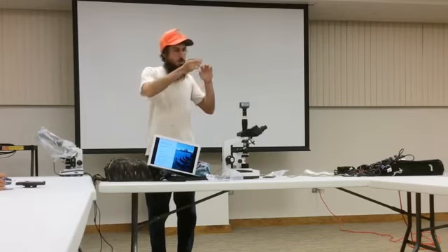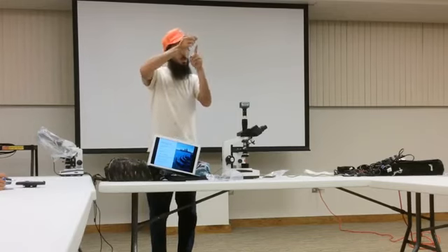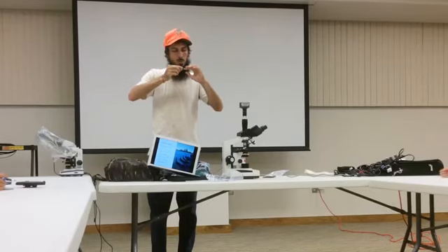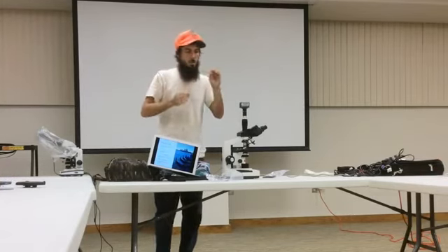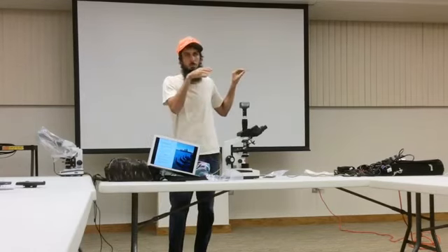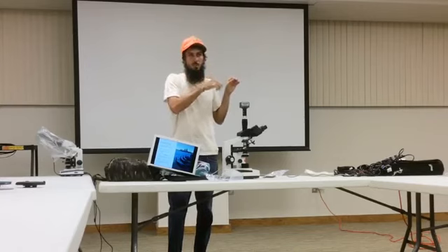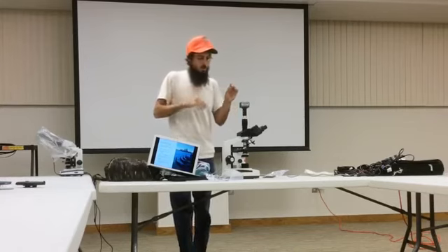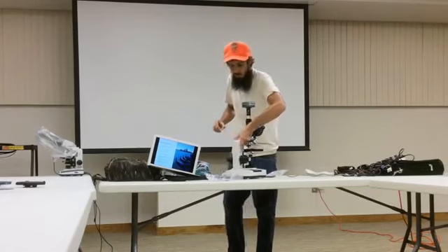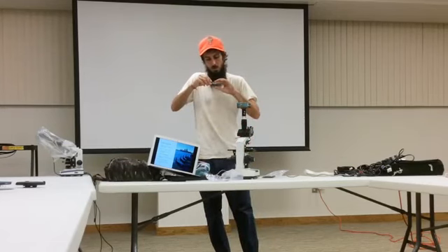And then I kind of, see how it's like all a cluster in the center? I kind of rub it around a little bit just to spread the water out a little bit. Try as best as possible to make it big. So you can see, I got almost over half the slide here. Probably could be better, there's a clump of dirt in it though that's keeping it from totally going on there. Spread that out. Actually, I probably should spread it out better.